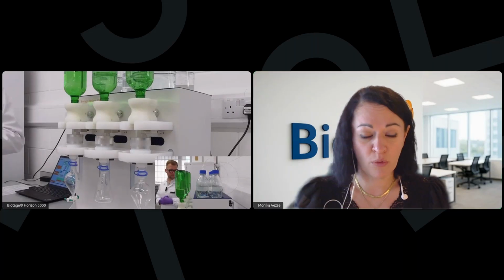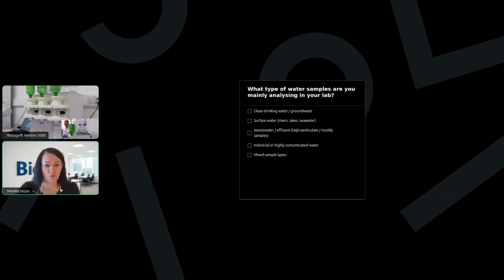Right, so whilst we are waiting for the loading, I'll take the next poll question. So we only have 2 left. This next one is about what type of water samples are you mainly using in your lab? So we have several categories: clean drinking water, groundwater, and then we have surface water such as rivers, lakes, and seawater, and then wastewater, including high particulates, muddy samples, and then industrial and highly contaminated waters, and mixed sample types.